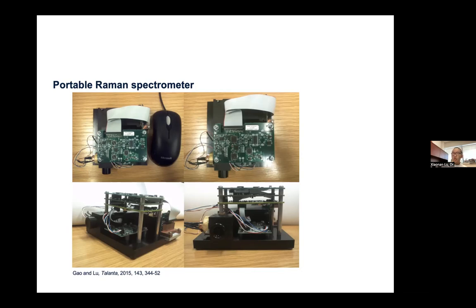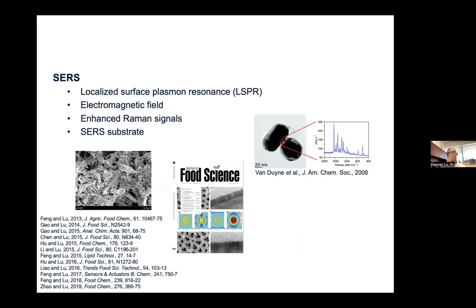So this saves a lot of time and labor for food authentication study. I want to go to another area, about using Raman spectroscopy to do characterization of microbiology or bacteria. This is what we call surface enhanced Raman spectroscopy.